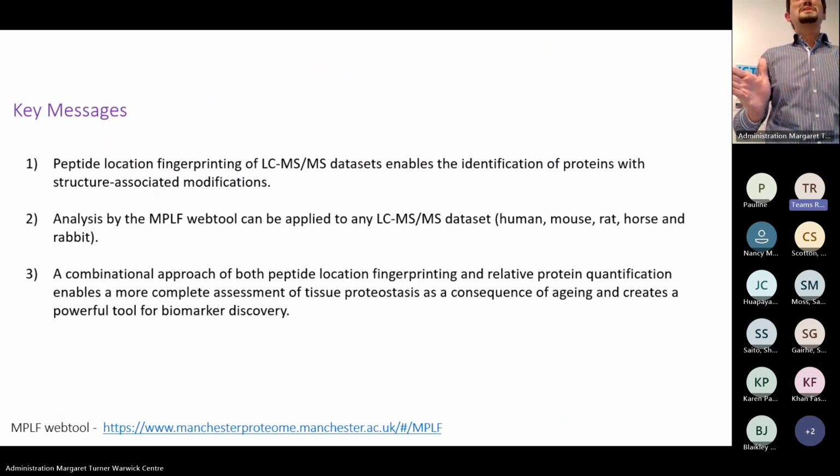It can be applied to any LCMS data. Right now, we've got human, mouse, rat, horse, rabbit. Those are the constraints. But if you do work on anything else, then we can do that. We can add that as well.